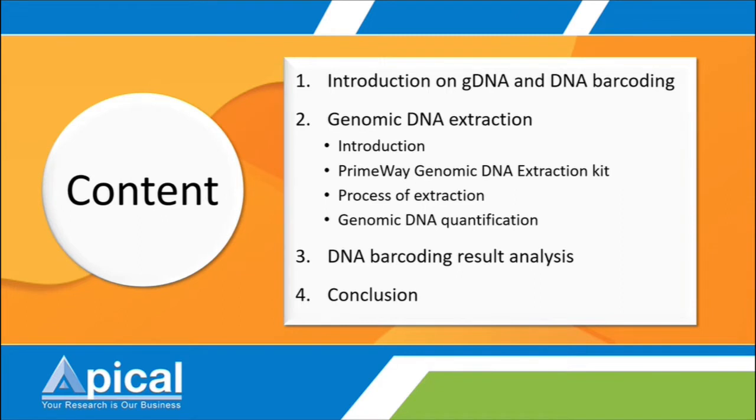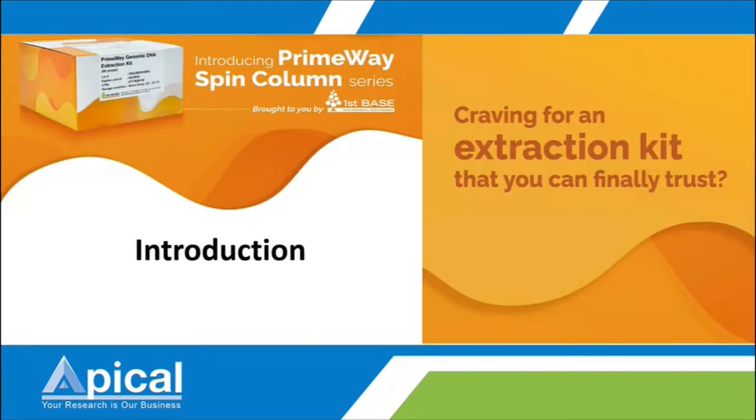Then I will talk a little bit about gDNA quantification and what results you should expect in order to be able to get the species you are studying when you perform result analysis. In the conclusion, I will wrap up the tips I have shared and what you learned from this webinar. Not to delay, let's start with the introduction.